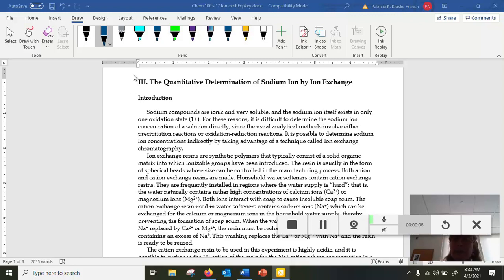This is the concepts video for the next lab, the quantitative determination of sodium ion by ion exchange. Now, this particular lab, we're effectively going to use a water softener.